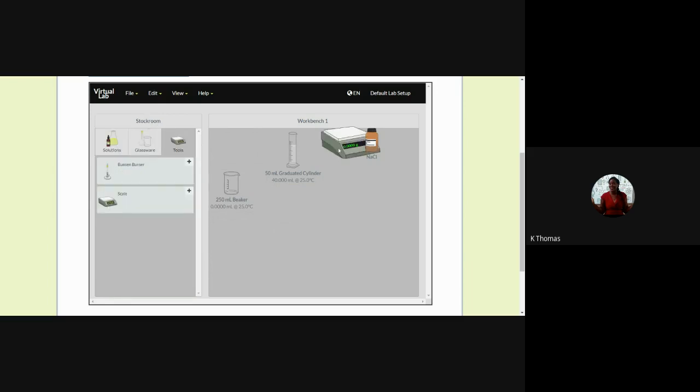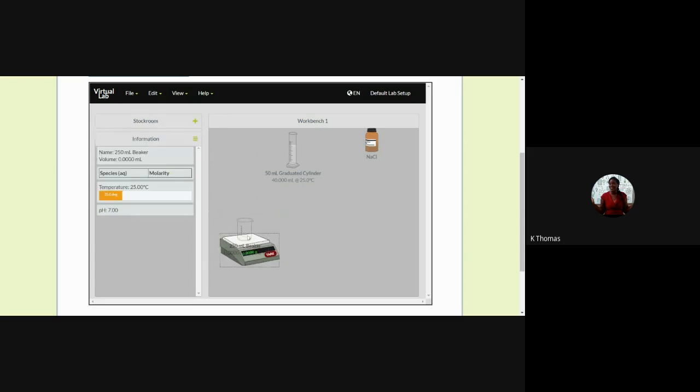I'm getting a next scale, one that's working properly. Put on the beaker. See, same 105.77 grams for the beaker. When I press tare, now you can see the balance working properly. Getting rid of that. Now I'm going to measure out how much. I said I would use 10 grams of the sodium chloride. So I'm going to measure that on the beaker.